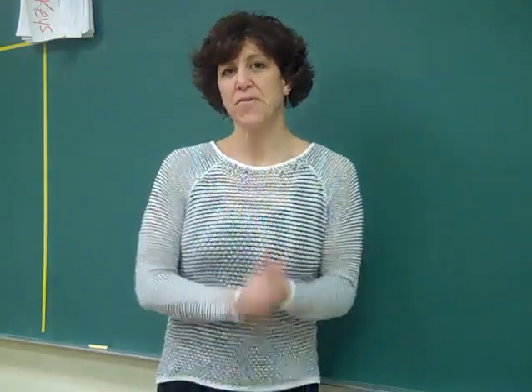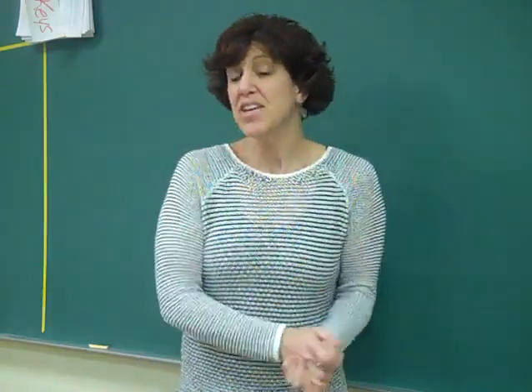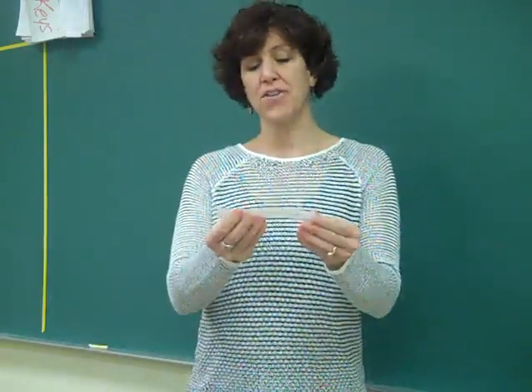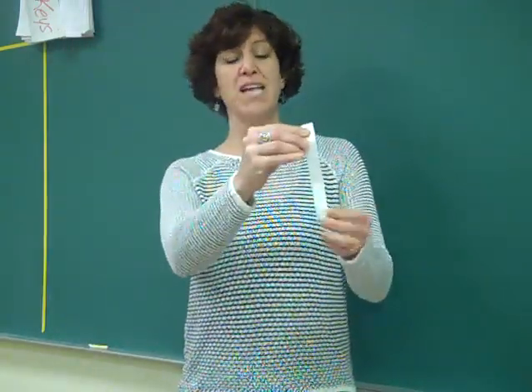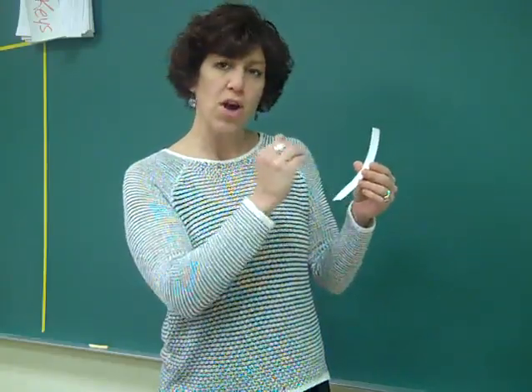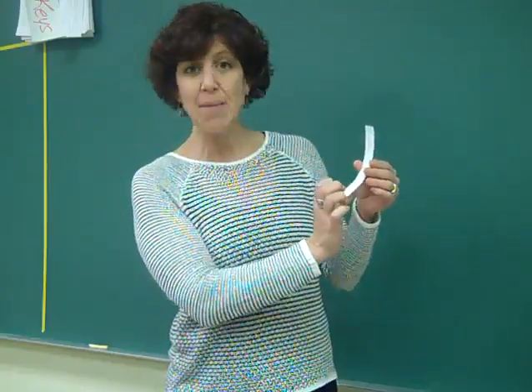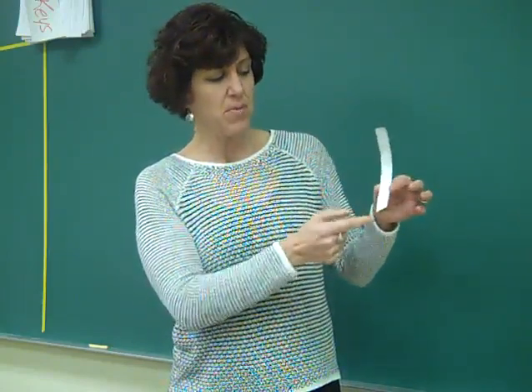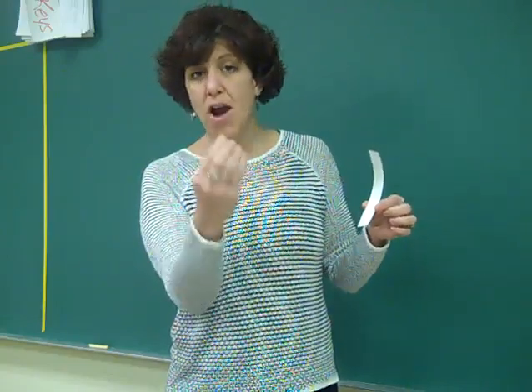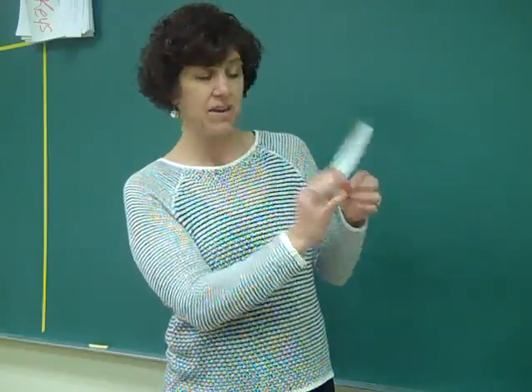I wanted to take a few minutes and explain some of the labs that you're going to be doing with photosynthesis. First thing you're going to do is a chromatography lab where you're going to take a strip of chromatography paper and you're going to roll like a quarter over a spinach leaf on top of the paper, probably about an inch up, and it's going to leave pigments from the spinach on the paper.